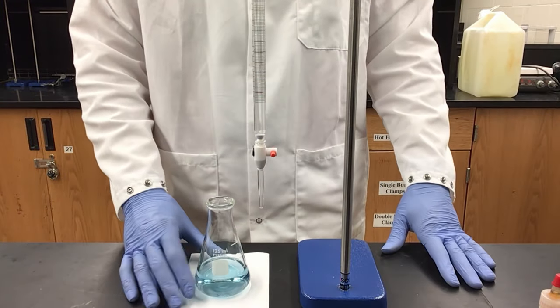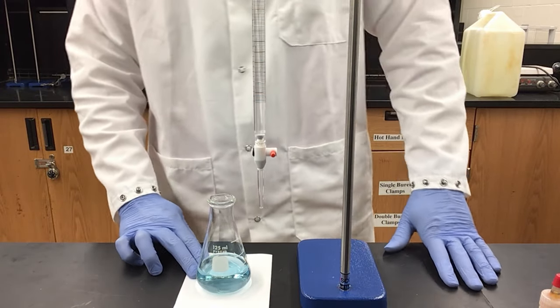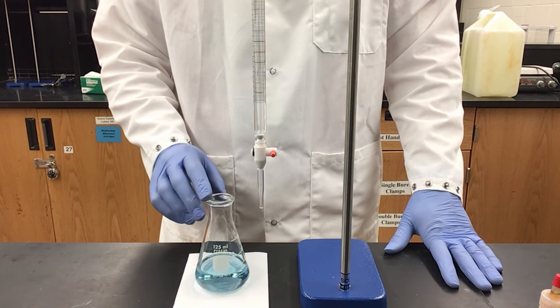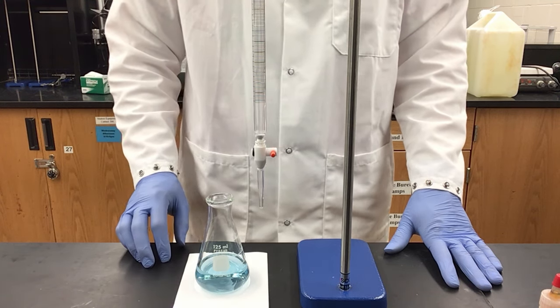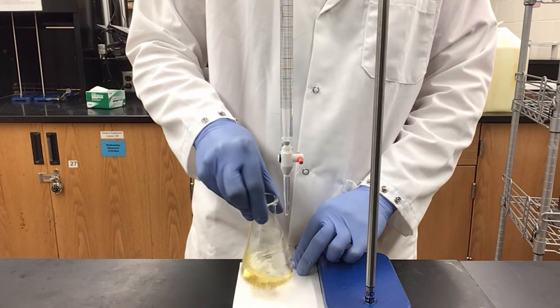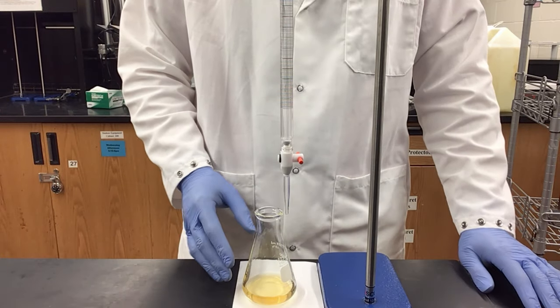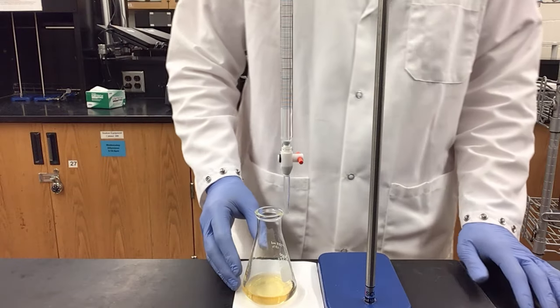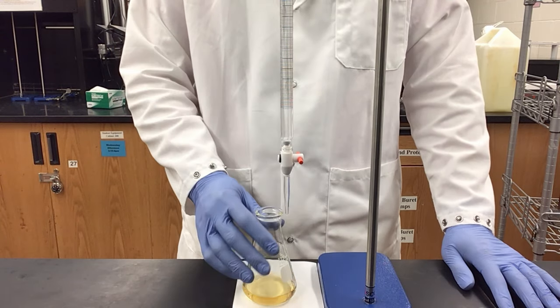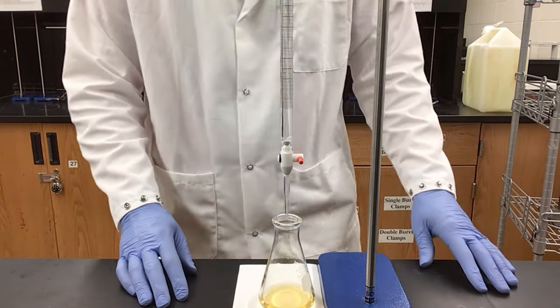As I was titrating I misjudged the color, and I now have a very light blue solution instead of the green I was expecting — which means I've gone over my endpoint. I'm going to need to re-titrate my benzoic acid. We are titrating until we reach a green color; if we reach blue we have overshot. With this mass of benzoic acid I have roughly 0.003 moles of acid, so with sodium hydroxide around 0.1 molar I should expect to use close to 30 milliliters.